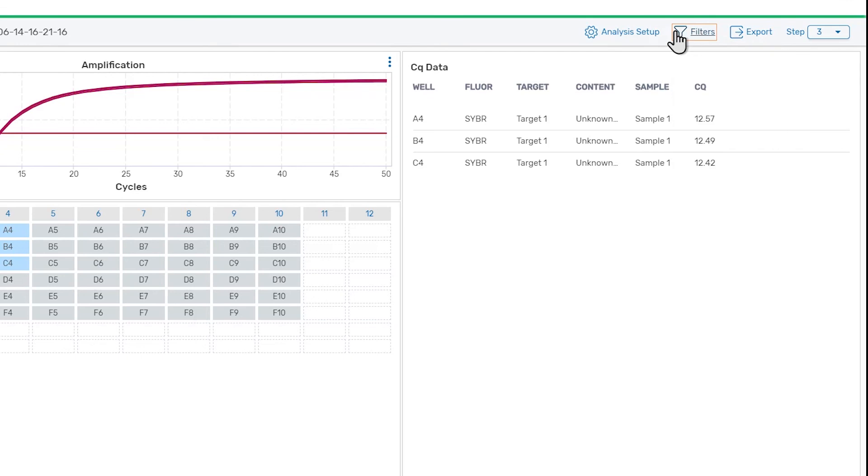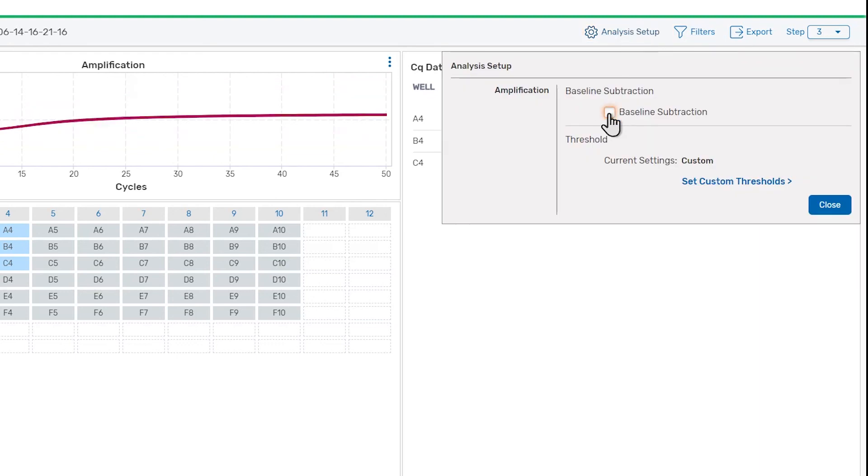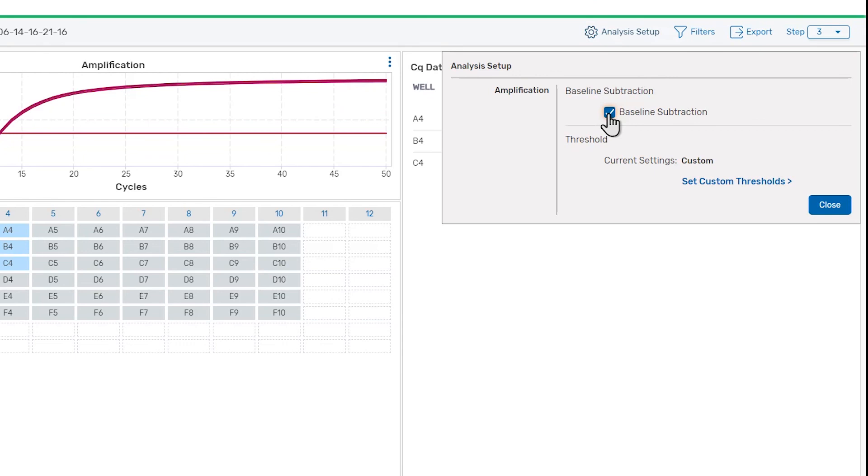If you want to inspect the traces without baseline subtraction applied, you can turn baseline subtraction off in the Analysis Setup panel. CQ values won't be calculated when baseline subtraction is off.